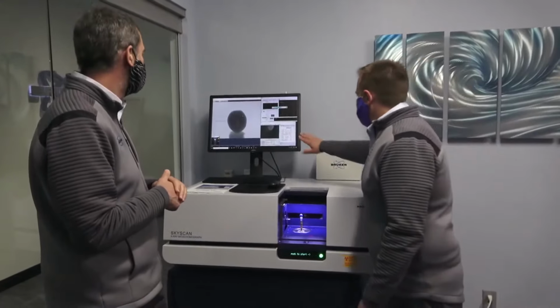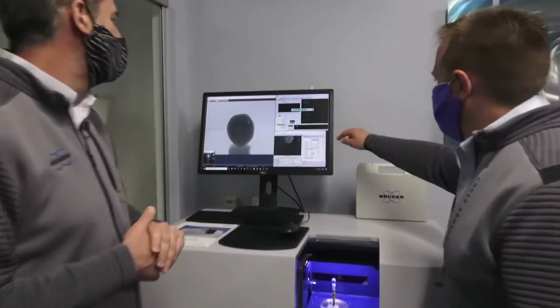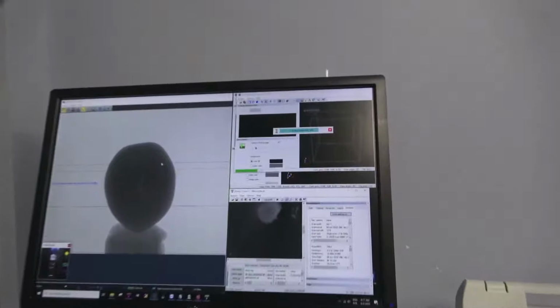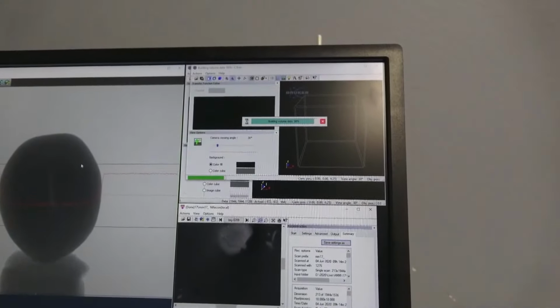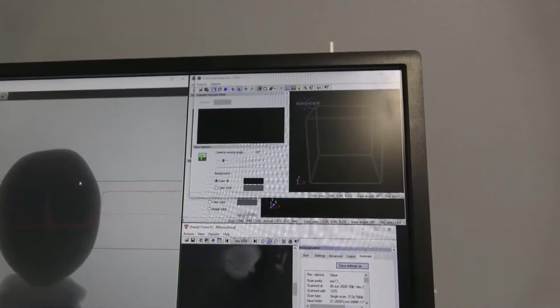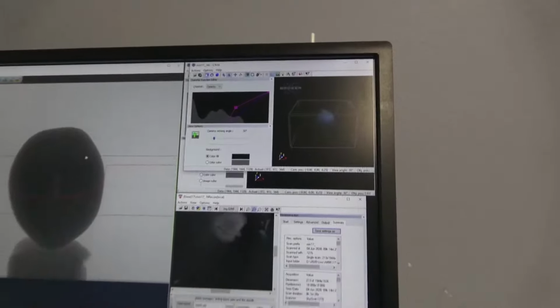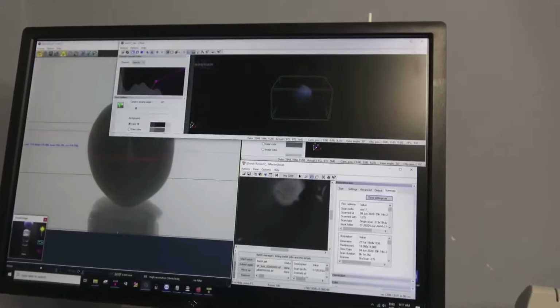So it looks like the reconstruction here is complete. Reconstructions are done. We're headed off to the graphical analysis package. All right, and there we go. It says 100%. And there we go. Okay, and it looks like you might have some controls here. Maybe we blow it up.